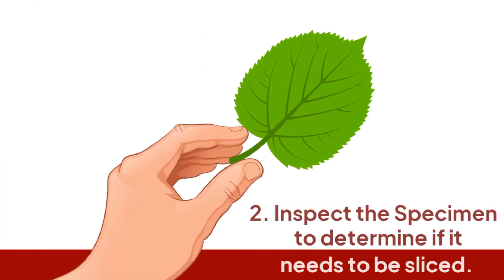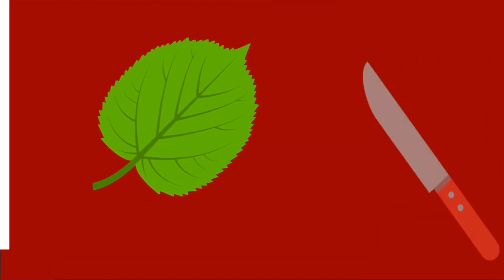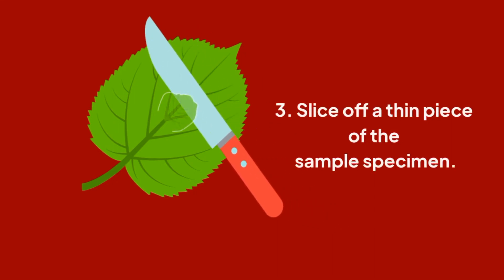Inspect the specimen to determine if it needs to be sliced, because it needs to be translucent in order for light to pass through. Slice off a thin piece of the sample specimen. Use a razor blade to cut your specimen.